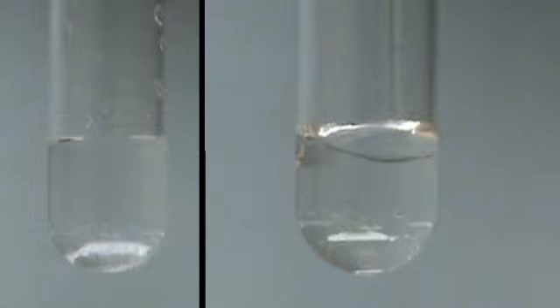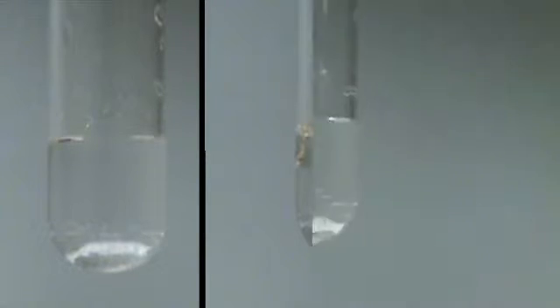Solubility of liquids is called miscible for soluble or immiscible for insoluble. Add the water to each test tube with the alcohol previously added and shake well.